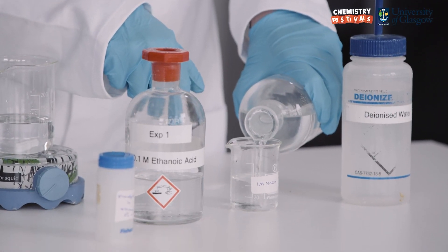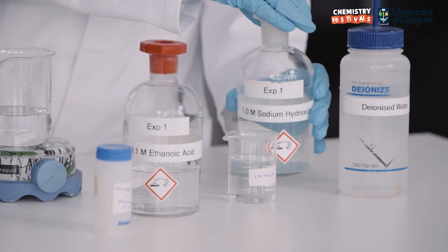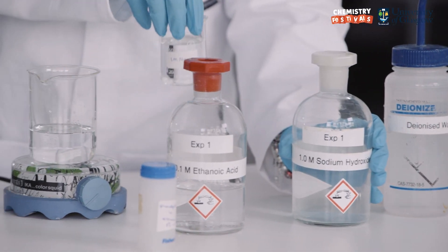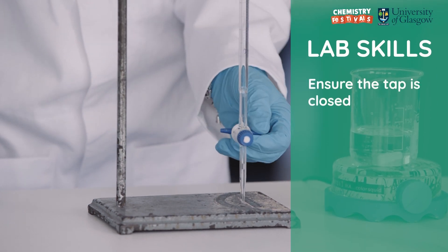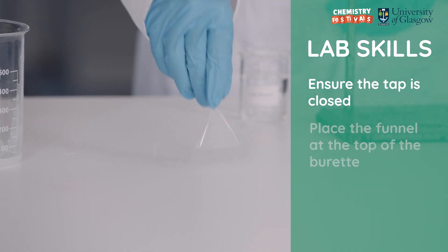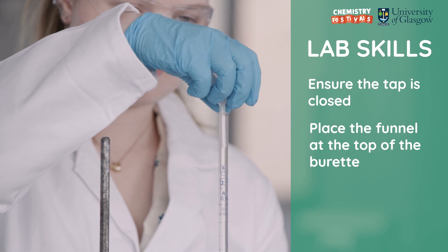First I'm going to pour out the sodium hydroxide solution into a small beaker. Now we are going to wash the burette. I'm going to make sure that the tap is definitely closed. Now I put the funnel into the burette.